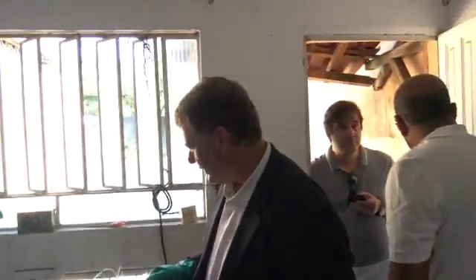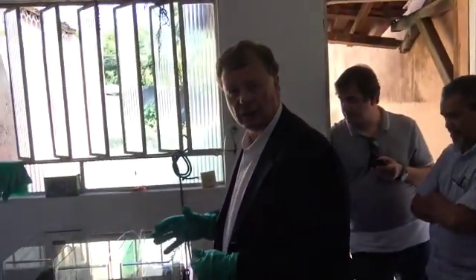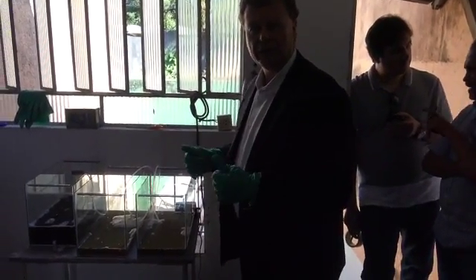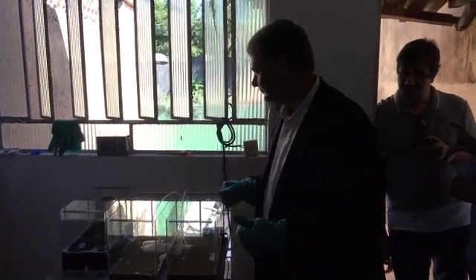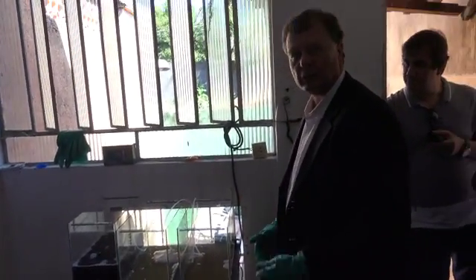Okay, back up. The next thing we'll do is, as you know, the RIO Bay is loaded with carbon, and so we'll need to inject oxygen to help break down the contaminants in the water. So we will now turn on an air pump, and we will run this experiment for 30 days.